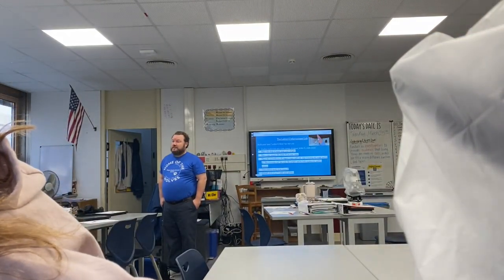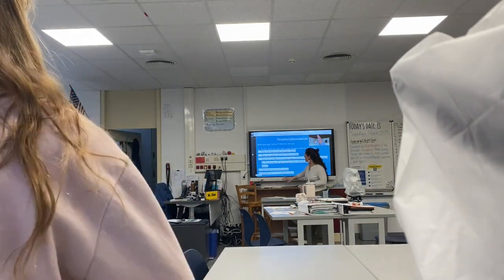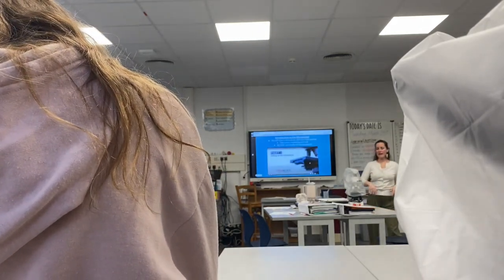Okay, if I can have your attention up here, this is a short, maybe one-minute video to show you the different parts of your particular microscope as we set it up, and then we'll walk through it together. We'll use this one as an example.